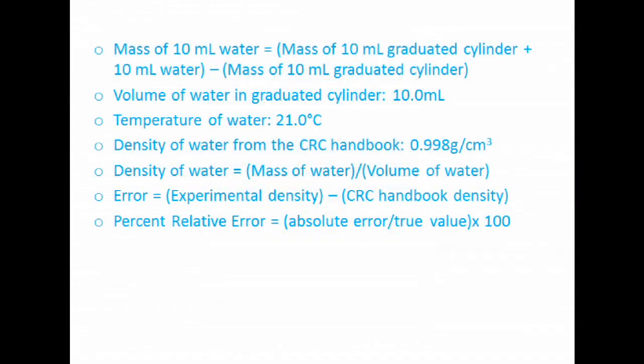The next few lines are given data such as the volume of water in the graduated cylinder, the temperature of the water, and the density of water from the CRC handbook. You may pause the video to record the given data.